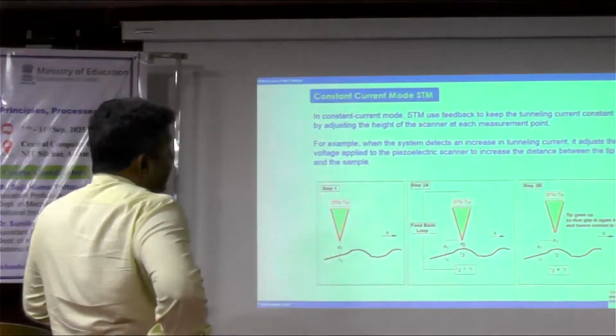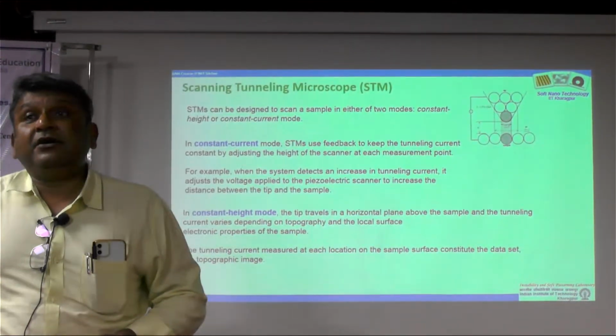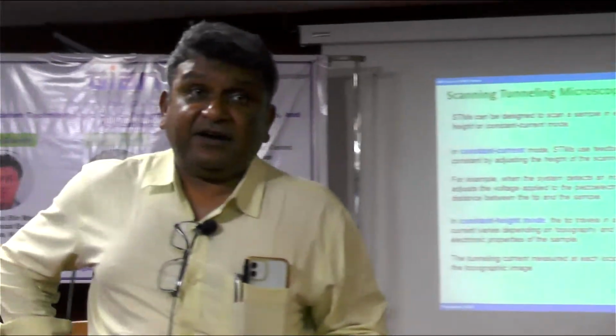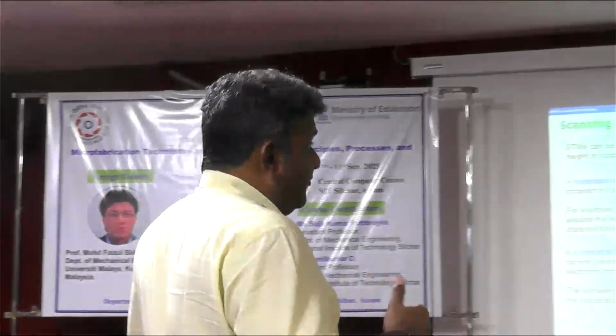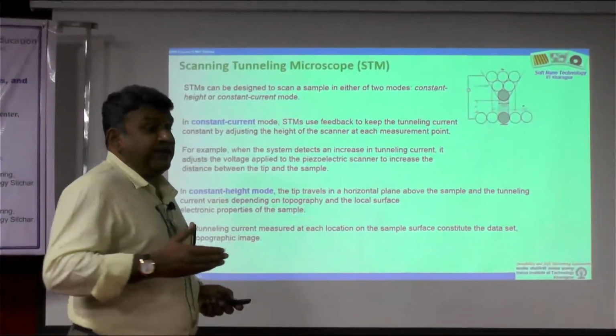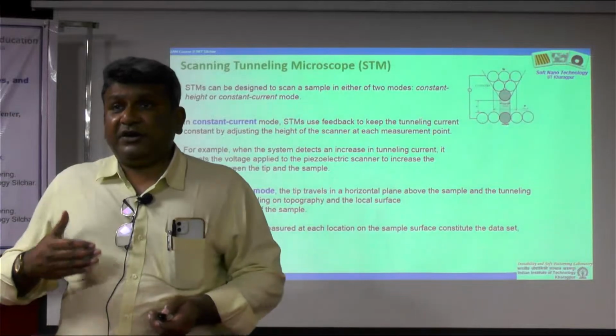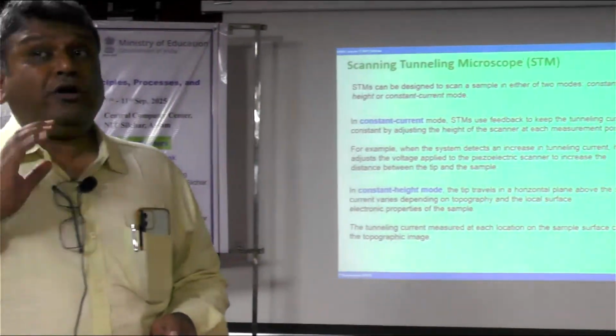But then what is the problem? Problem is this whole thing is actually limited only for conducting surfaces. And there are a large number of non-conducting surfaces like ceramics, polymers, etc. The inventors realized, thankfully, that such a beautiful and powerful technique cannot be used for these type of non-metallic materials. So therefore, they started to think if anything can be done to discover or develop something similar, which works for non-metallic material.